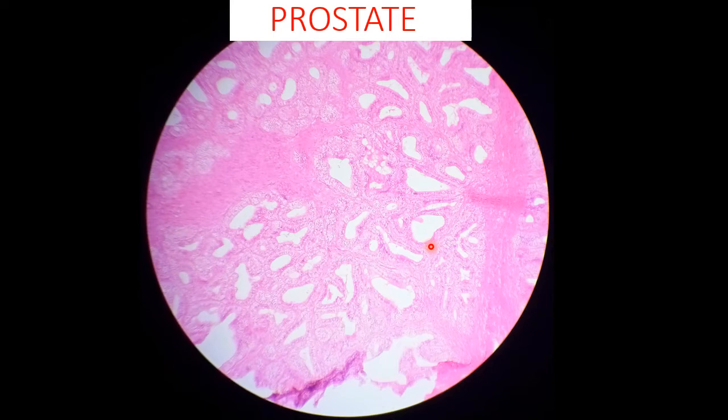The mucosa is thrown into folds and the lumen contains corpora amylacea. So the lumen consists of corpora amylacea. Here I am not showing that corpora amylacea. And acini are separated by a thick fibromuscular coat. This is one fibromuscular stroma. So that is how we have to identify the prostate.